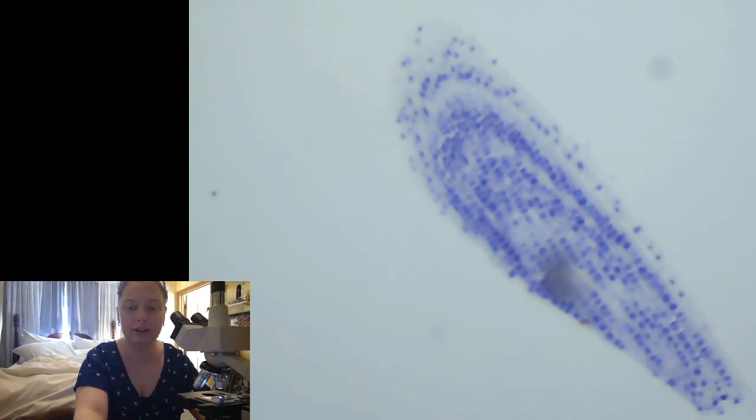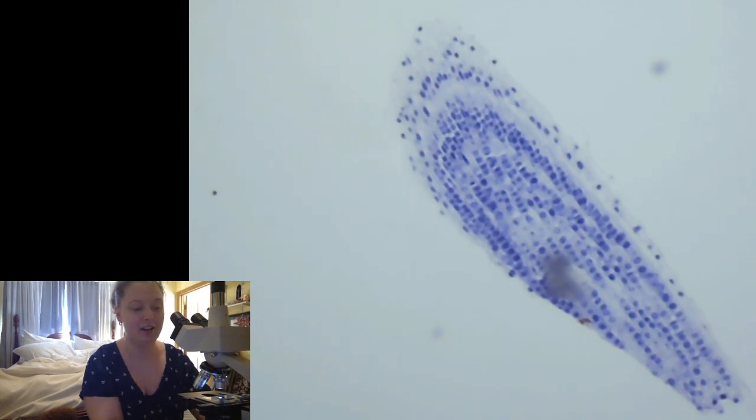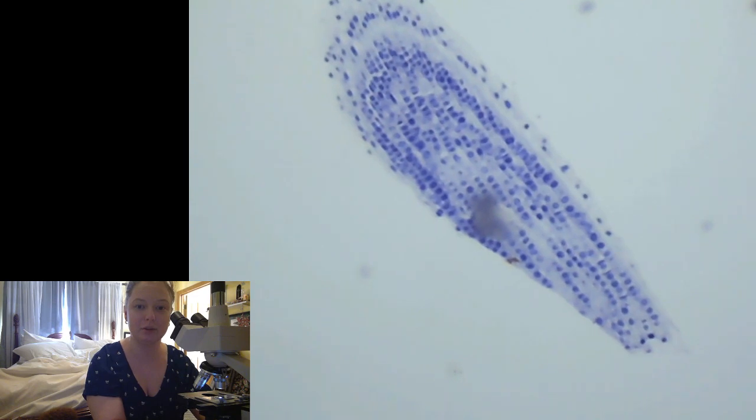Let me see what I can get here so I can look, because I want to see what you're typing, but I can't see in the YouTube viewer as well as, there we go. So here we go. We're seeing some cells. So the first thing we're going to look at today is actually the mitosis slide. So if you're in biology class with us, hopefully you remember mitosis. So we can move it over a little bit too, so you can get a little bit better view.